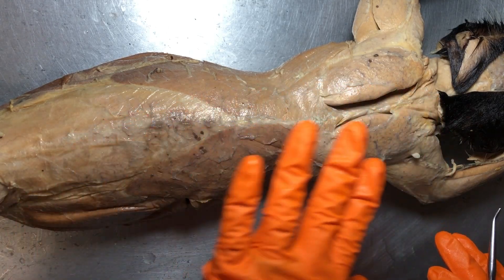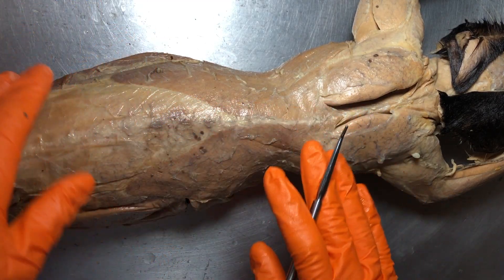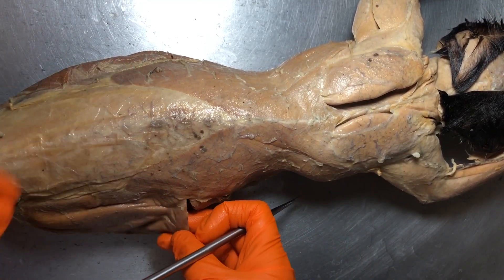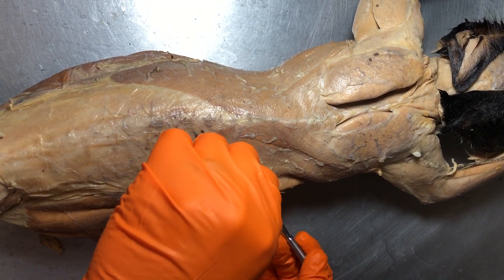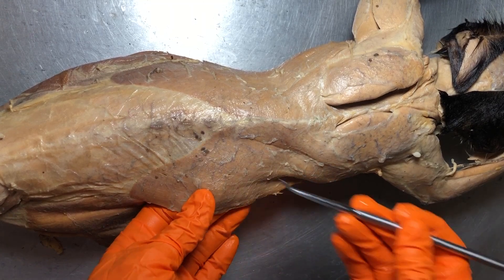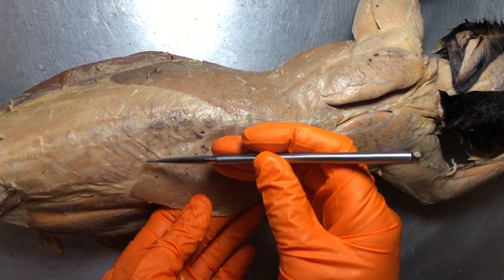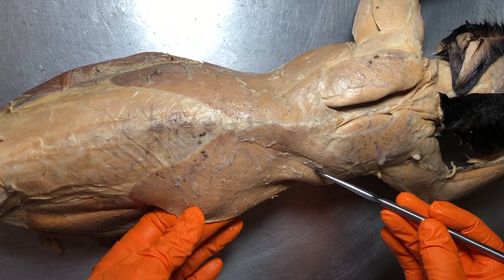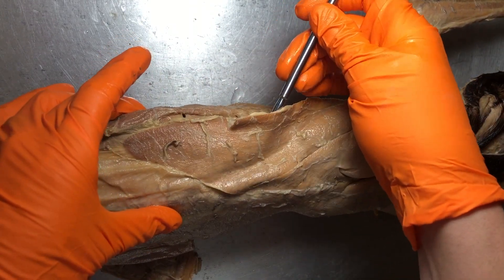We're looking at the dorsum of the kitty. Remember that the dorsum of the cat is the superior side because it's a quadruped. There are some big major muscles to show here. First, we have the very large latissimus dorsi and there will be two of them. You can actually see some tissue here called the lumbodorsal fascia, which helps keep this down. This is going to be the right latissimus dorsi and this is going to be the left latissimus dorsi.